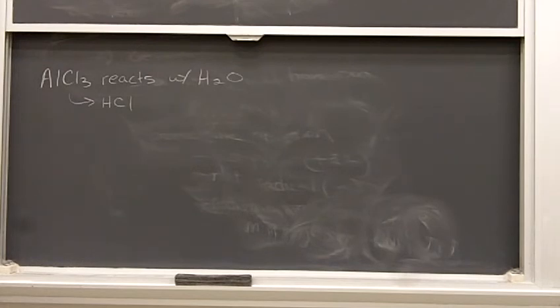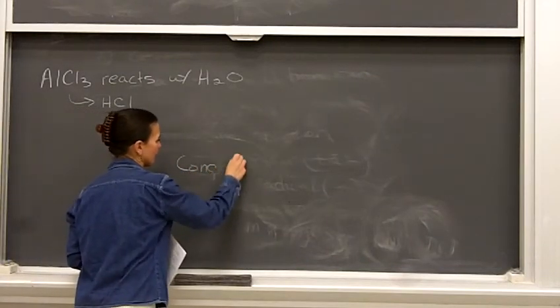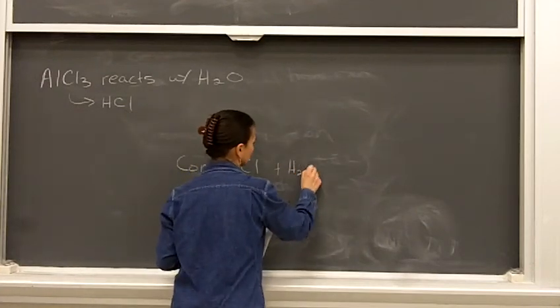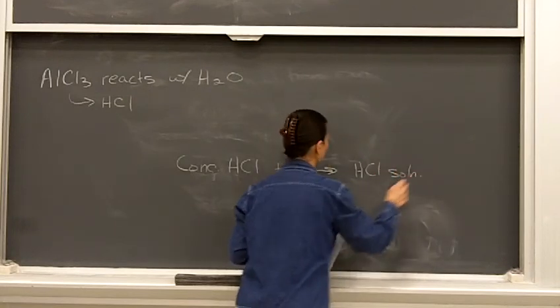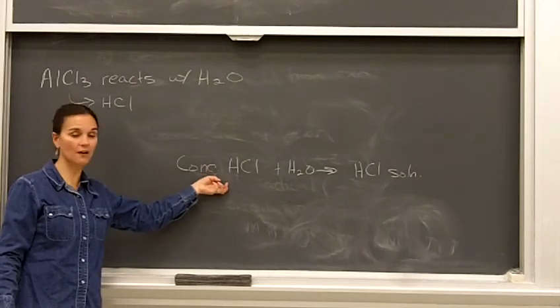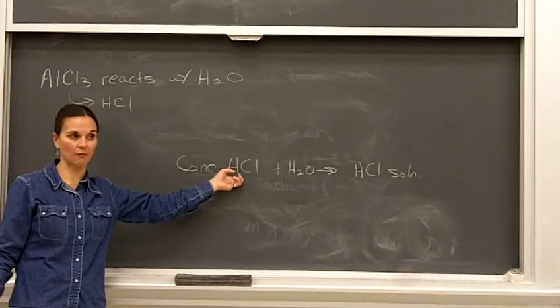You're going to prepare that from 12 molar HCl, okay? So you've got concentrated HCl, and then you're going to use that to prepare this solution. Be careful handling the concentrated HCl. Use gloves, don't spill it. If any is spilled, let us know so we can clean it up right away, okay?